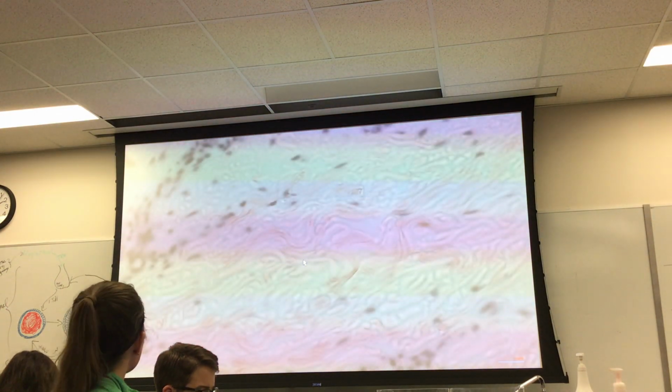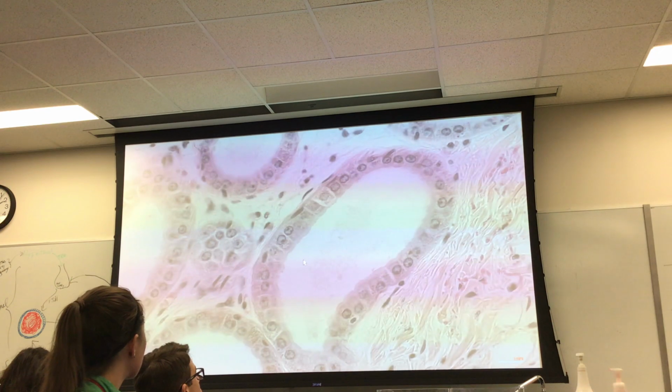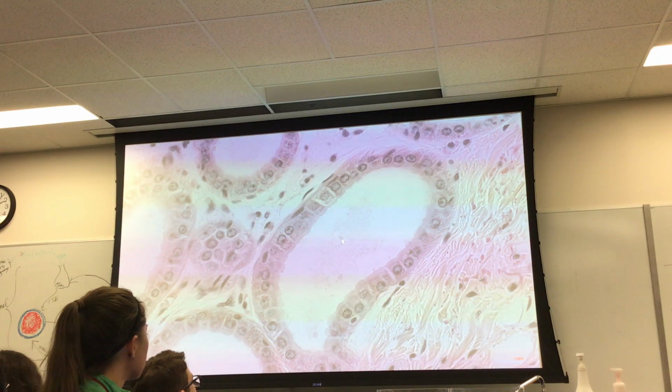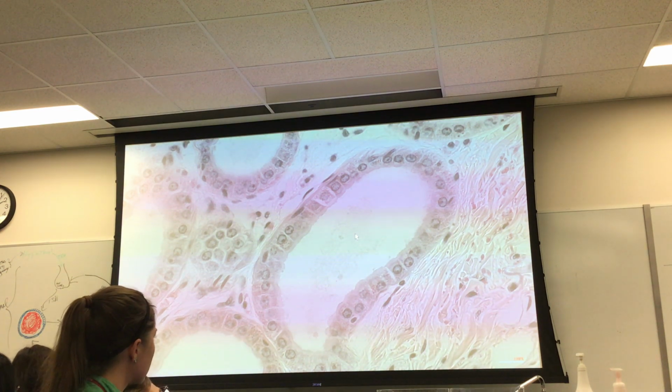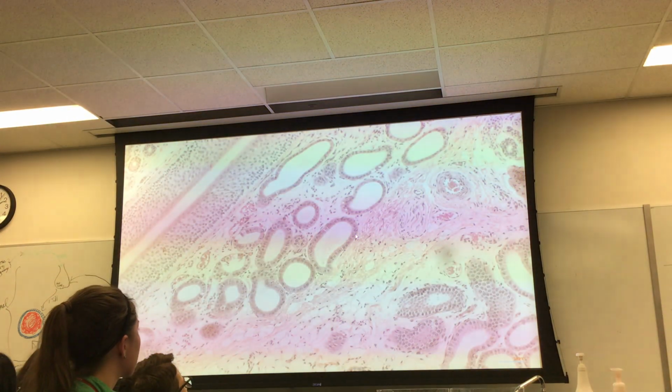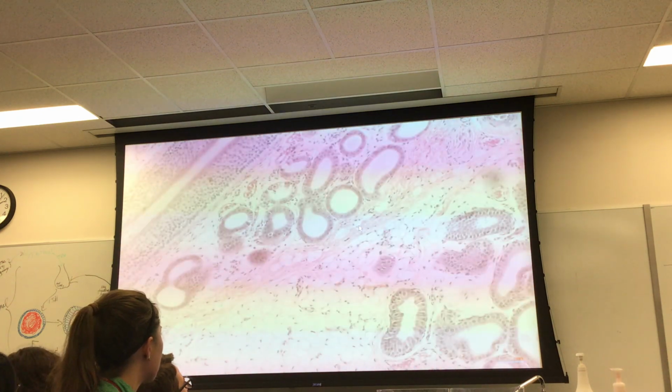All right. So I'm going to just on this same slide come down here. Keep going. What is that? Now, this is context driven. So you would have had to have established that this is skin. And in fact, I guess to really be fair, what you would see is an image perhaps like this, with this thing in view. That's a hair follicle.